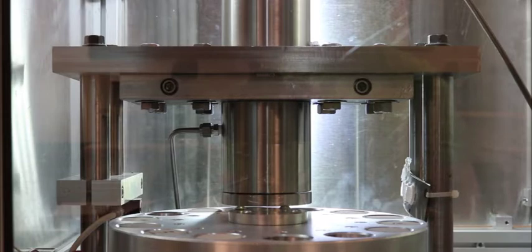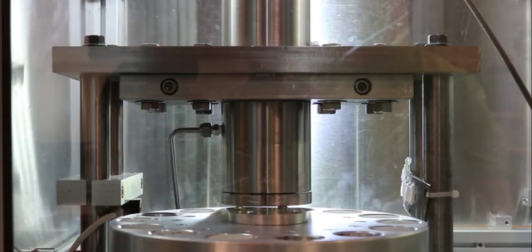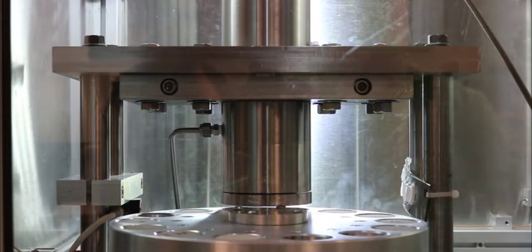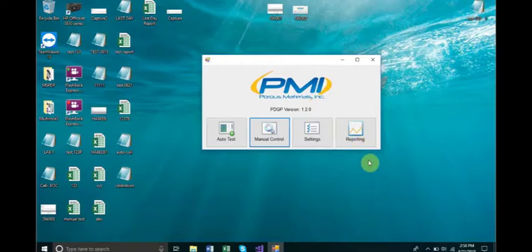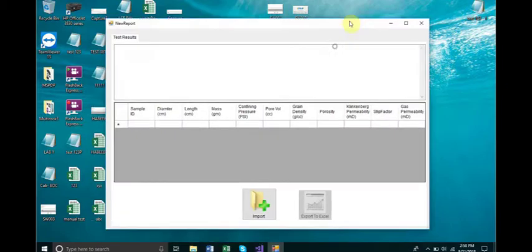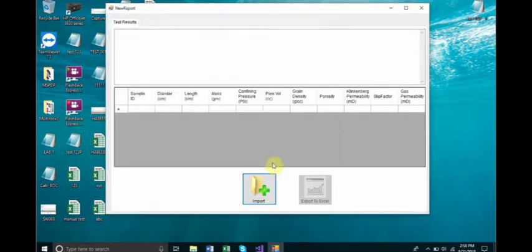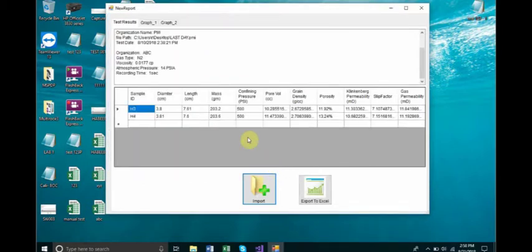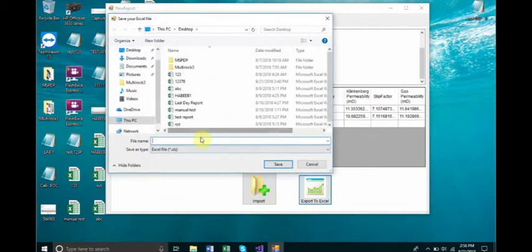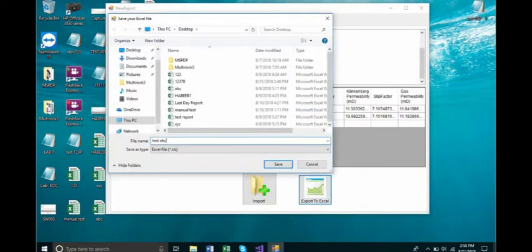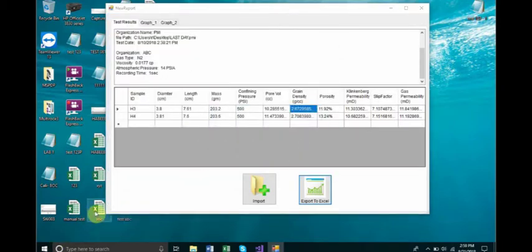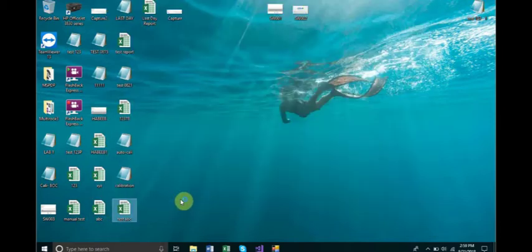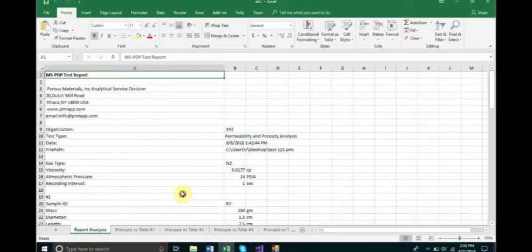After completing the auto-test measurement of core samples, the user may see results using the reporting section of the APDPHP101 software package. To begin, starting from the main menu, click the Reporting button. This will bring up the reporting window. Then, at the bottom of this window, click the Import button. Navigate to the desired data file and click Open. Results will be displayed in the chart located in the reporting window. If desired, the user may export this report to an Excel file by simply clicking the Export to Excel button. Create a name for the file and choose a path to save. Then locate the file and double-click it to run and see results in Excel. The user may click on several tabs in the Excel file to see results in numerical format as well as charts showing pressure over time measurements.